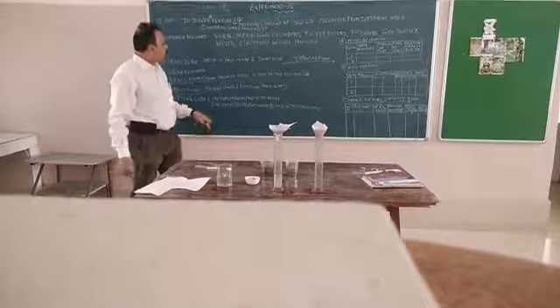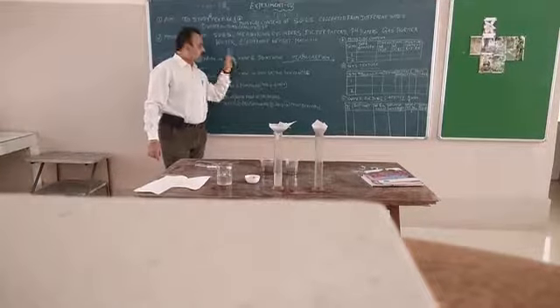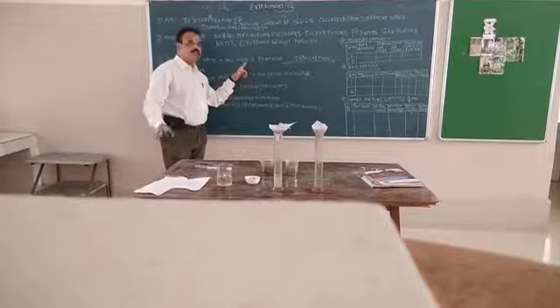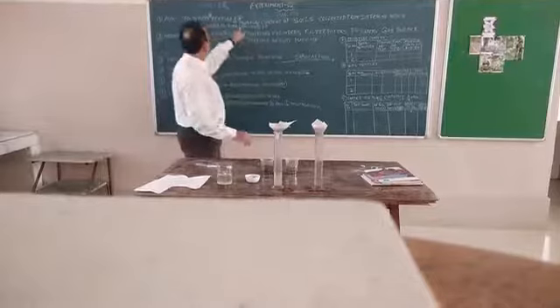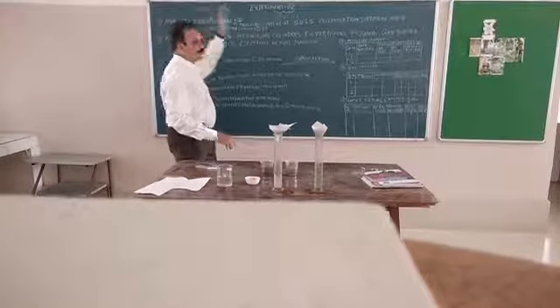Procedure. I have already told you, you must write the procedure in past tense because you are going to do it yourself, and point-wise. Don't write paragraph-wise. So to begin with, we will see the texture.